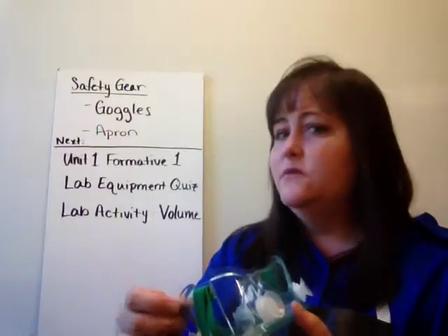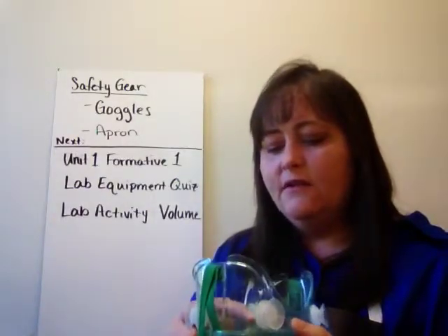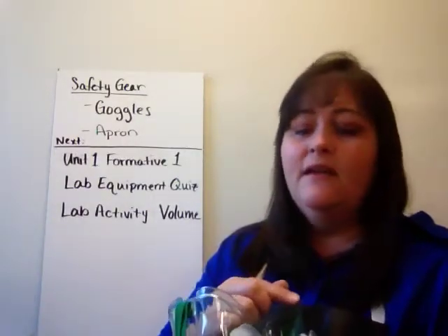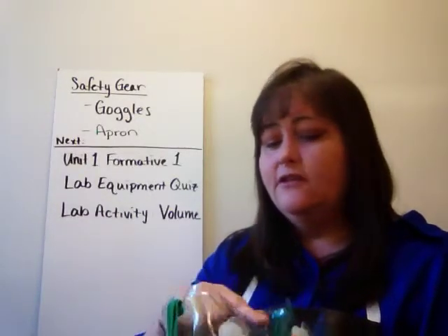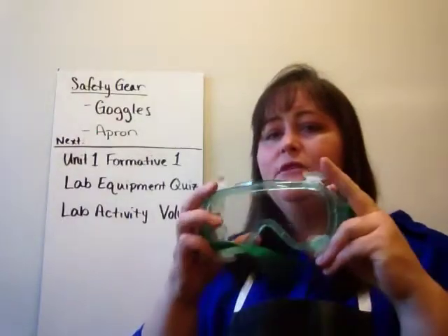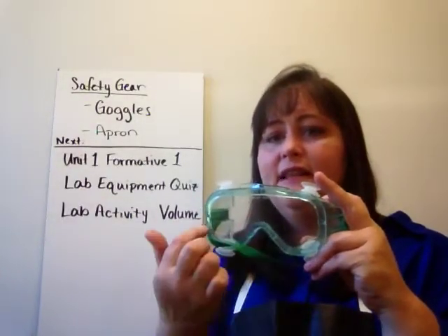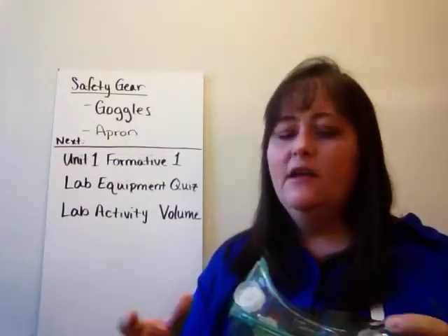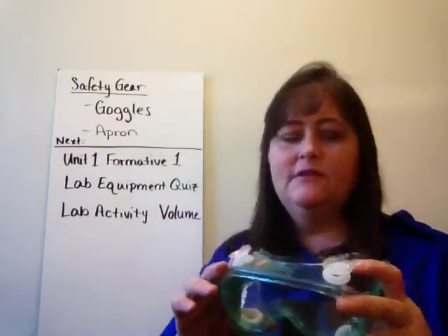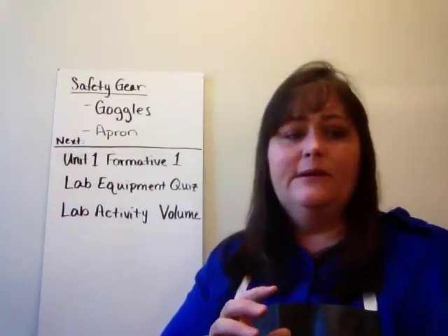This kills any germs, bacteria, anything that might be on there left from the last person that used them, so that you don't share germs. That's all there is to it. You're just going to do that part. You do not want to clean this part unless it's necessary. If this part needs to be cleaned, I'll be glad to clean that for you so that you don't have to look through smudges. Be easier to see that way.